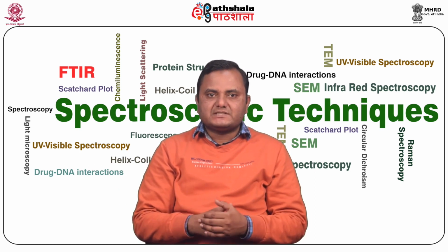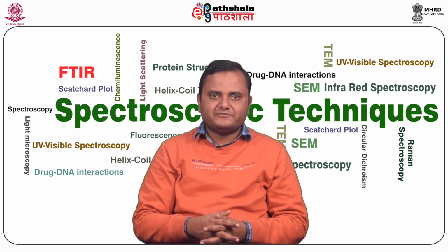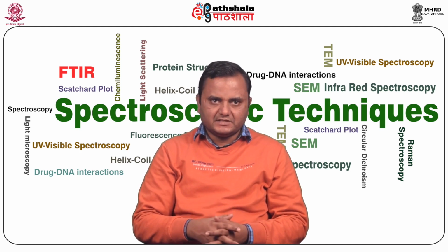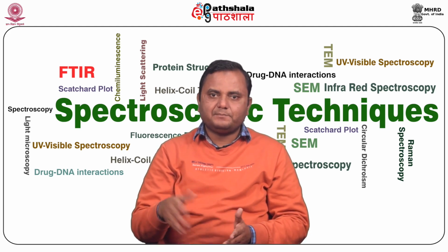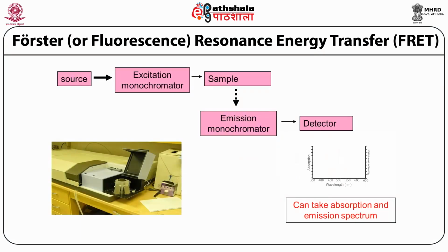The use of fluorescence radiation is of fundamental importance for tackling measurement problems in the life sciences. Fluorescence methods provide high sensitivity and greater versatility while minimally perturbing the cells under investigation. We discuss the fluorescence instrumentation.